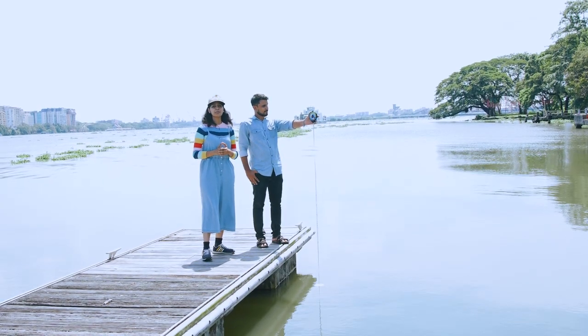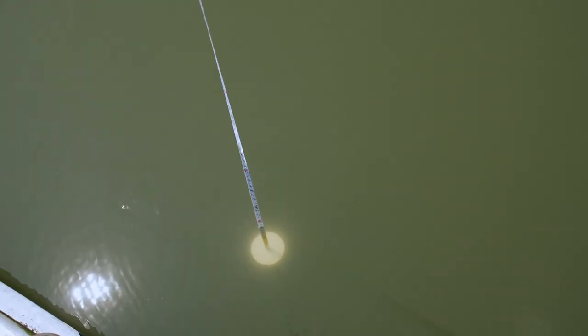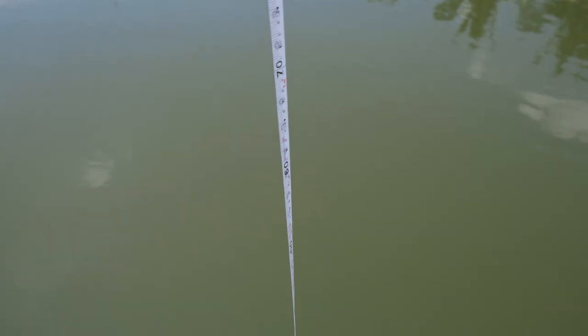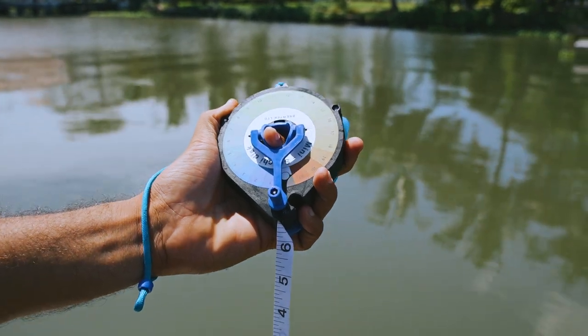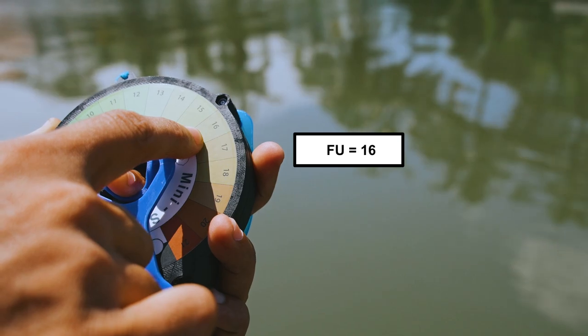Now let's proceed to measure the color of the water. The Secchi disc is now at roughly half the Secchi depth. Match it to the closest color on the color scale and note the corresponding Forel-Ule number.